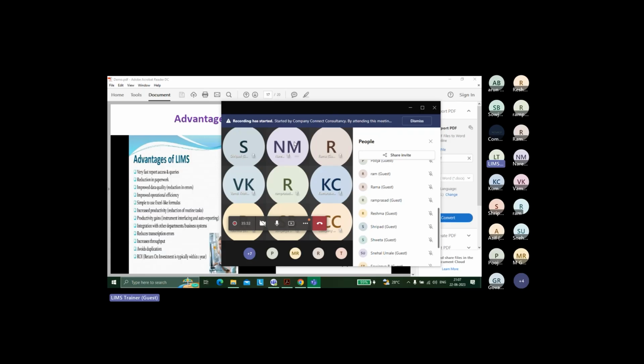We'll cover a lot of modules for LabWare. We'll start with master data creation, how to work with master data, what a sample is, test is, result is, what product, grade, stage are, where we create master data, and what a variation is. What is the sample life cycle, and how can we relate that with the database? What is the table structure for the most commonly used tables, how to write queries, how to write joins, and how we can use those joins in LIMS. What is a primary key, foreign key relationship. I'll write some simple queries online, in W3Schools, and show you how to write queries. I'll just show you what a relational database is.